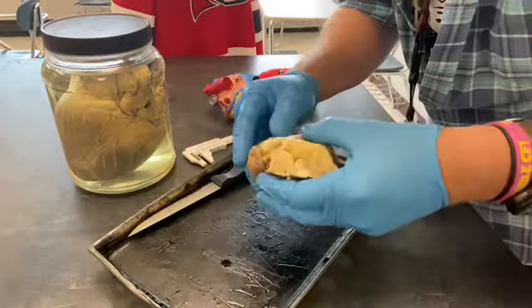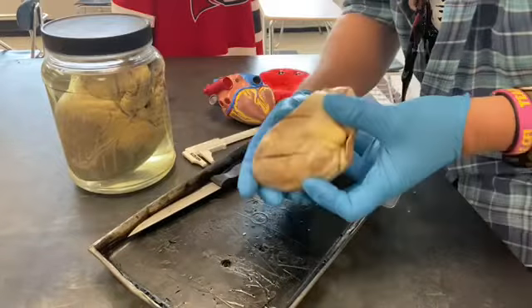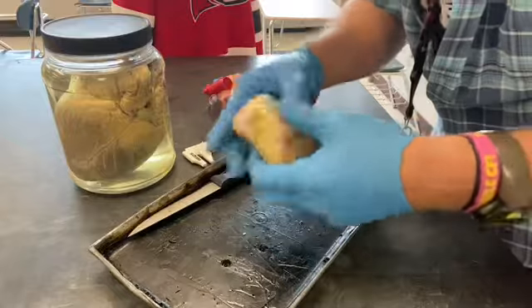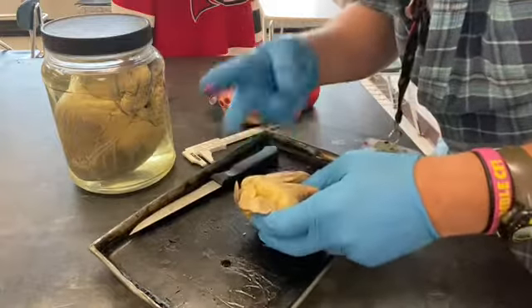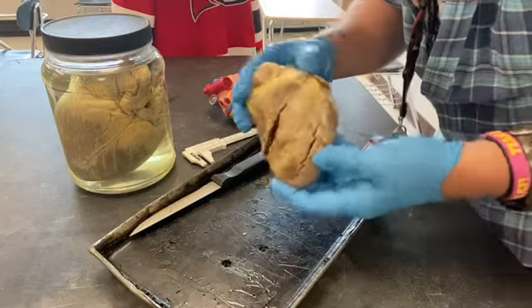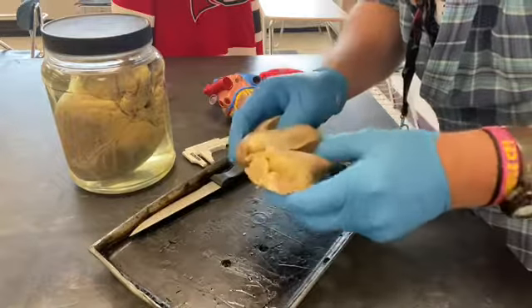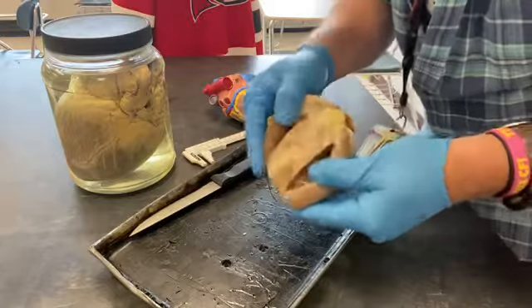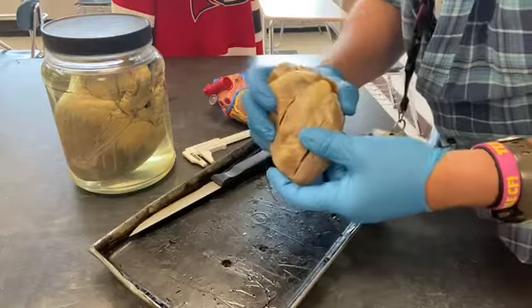In class today, everyone here is going to handle the heart and find all these different parts. People joining remotely will watch this video and watch what we do in class. Part two is labeling a diagram of the heart — valves, aorta, arteries, atria, ventricles. Part three is watching another dissection video.